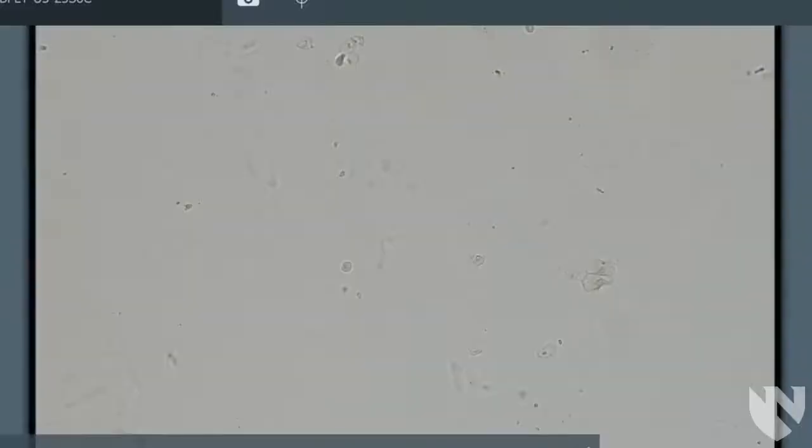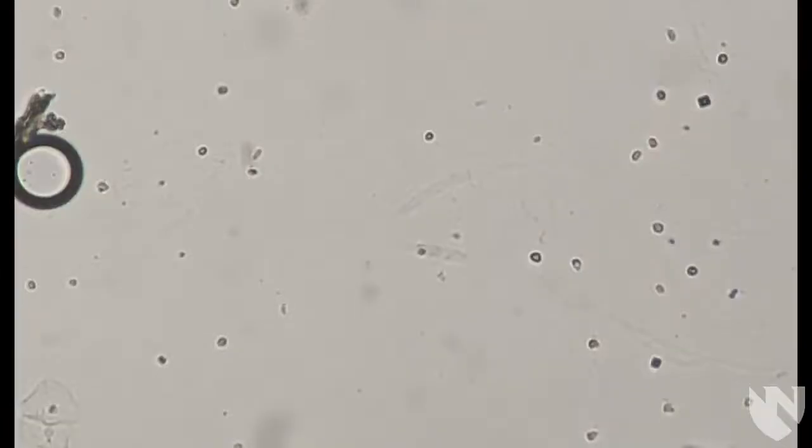While on the 10x objective, we will enumerate any squamous epithelial cells, casts, and mucus we see. Begin by scanning the perimeter of the slide and scan a minimum of 10 to 12 fields.